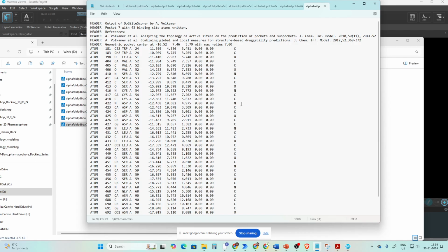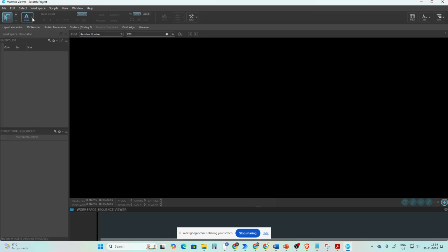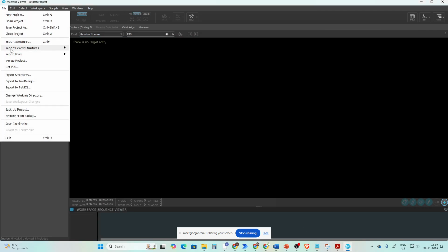Okay, one more cysteine residue is there, the same cysteine residue as the fourth one. So we have this last one, this fourth one, and the first one. So let's see which cysteine residue is the catalytic one.